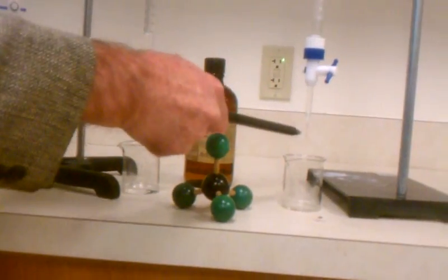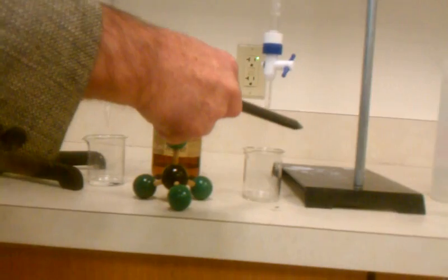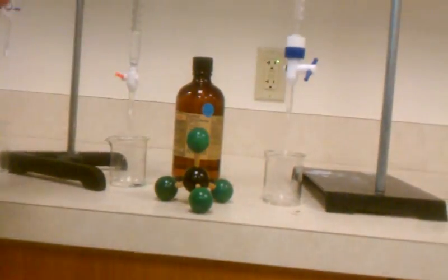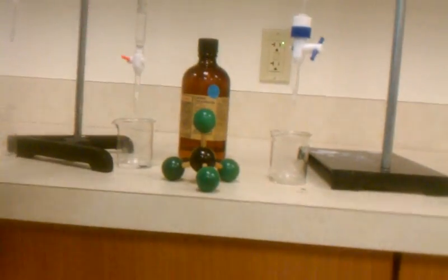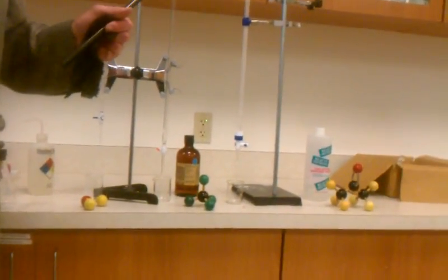Well, that seems to be diverting even further than the water. Look. Oh, the stream missed the rim.